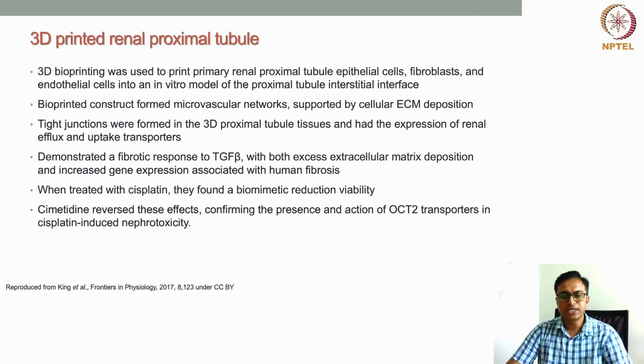The next study is also by King et al. They have produced a renal proximal tubule by bioprinting, with endothelial cells, fibroblasts, and epithelial cells, an in vitro proximal tubule interstitial interface. They bioprinted endothelial cells and epithelial cells, and fibroblasts and epithelial cells were used to develop this interstitial tissue.